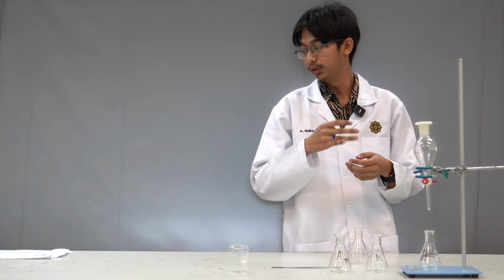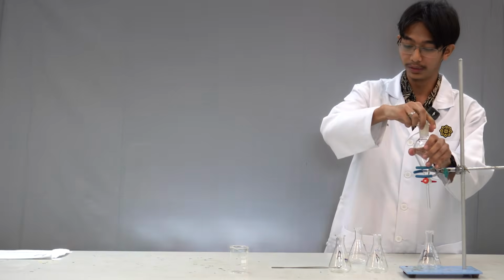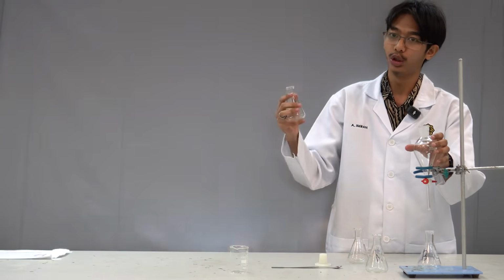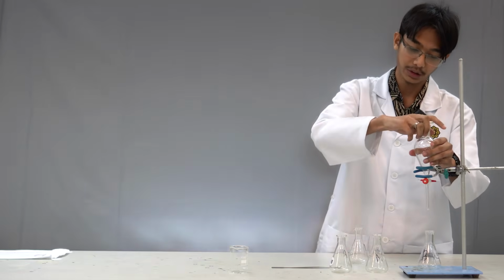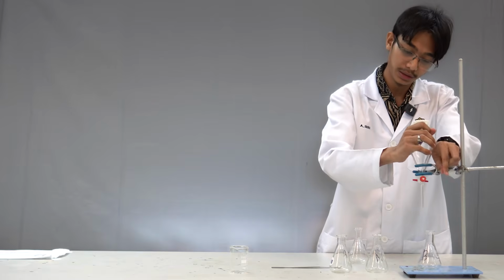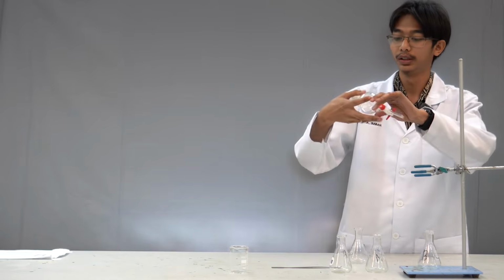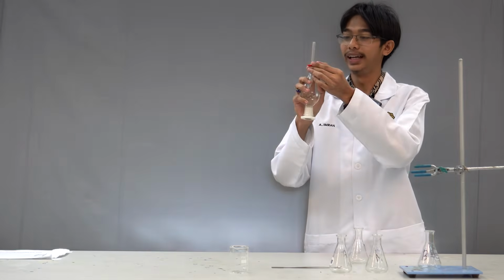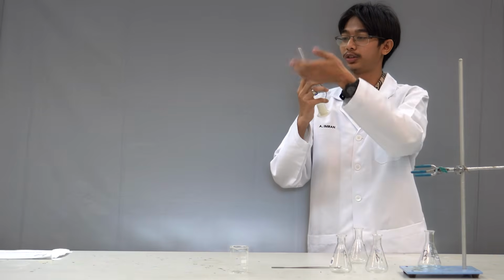We know that acid reacts with base, right? So what we do is we're going to add base. Adding into our funnel, we're going to add sodium hydroxide. We just add it in, then you cap it, and then you pull this thing out. You notice that it's going to be mixed. To mix it, you're going to have to give it a little shake, of course. Also make sure that this is horizontal, so that if you're shaking, it won't spill out from this side.